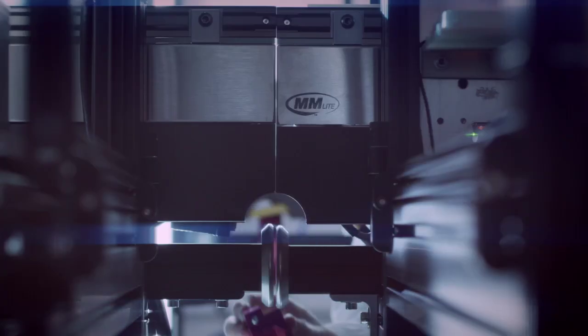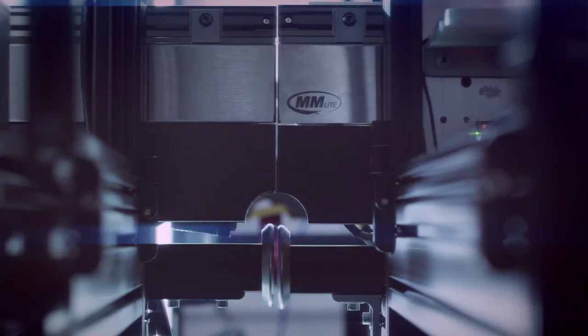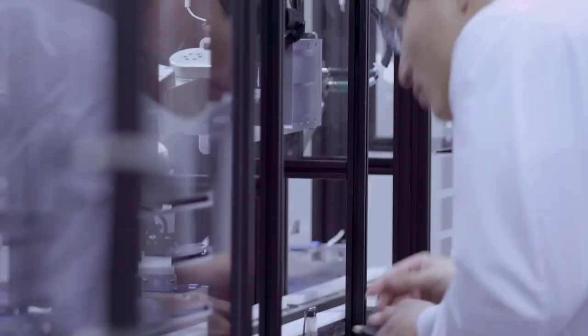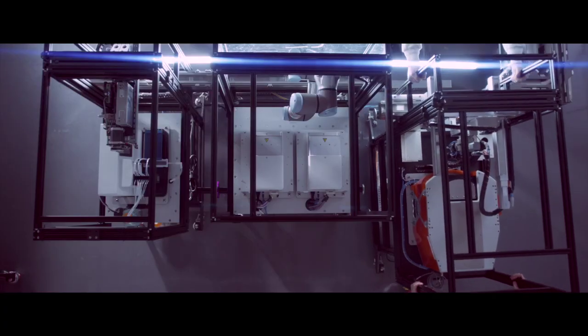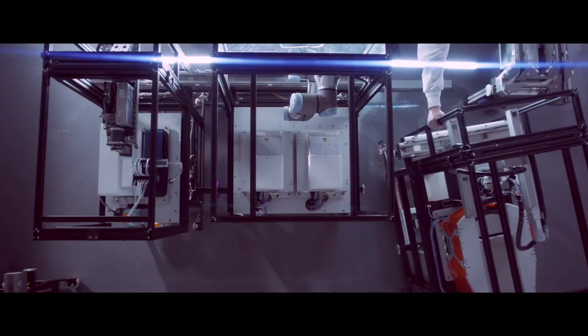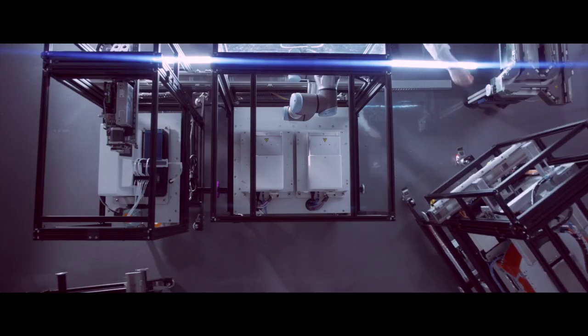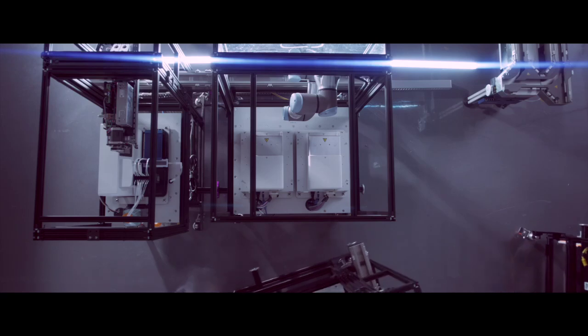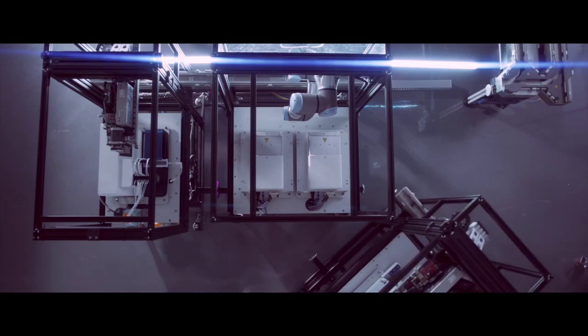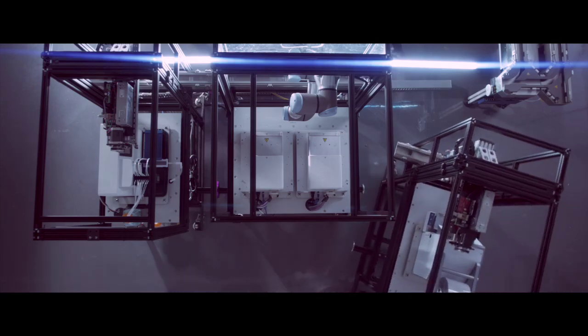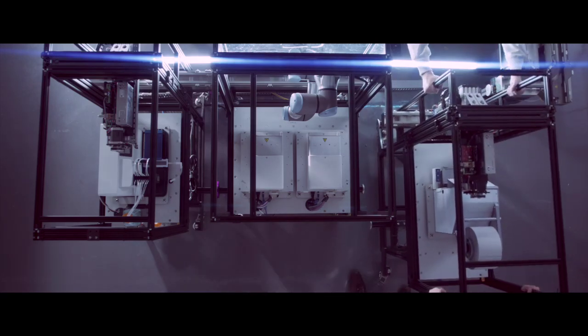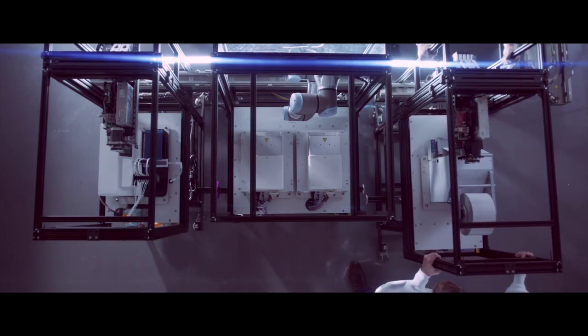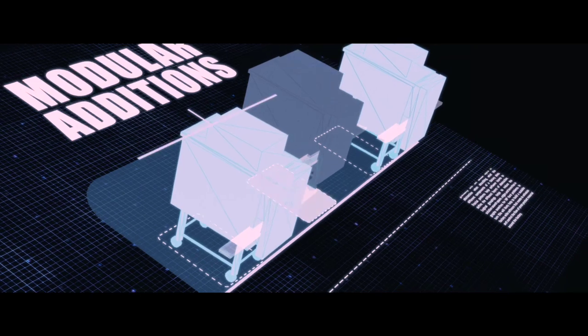Quick connect infrastructure enables reconfiguration or expansion of your rack system in minutes. Connect two, ten, fifty, or more racks to form a system that supports the throughput and complexity that you need today.